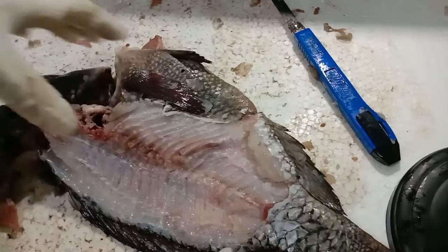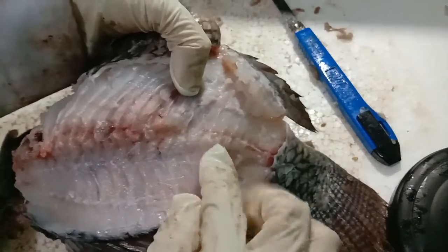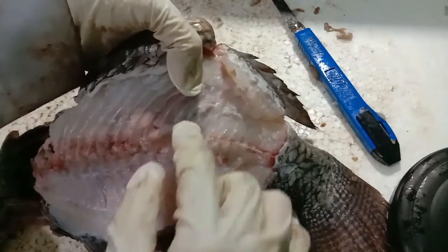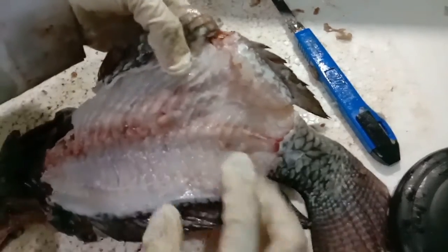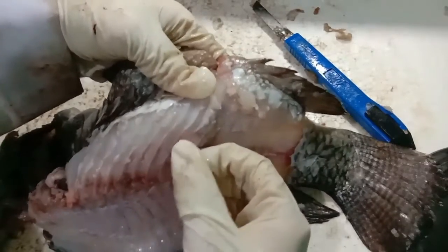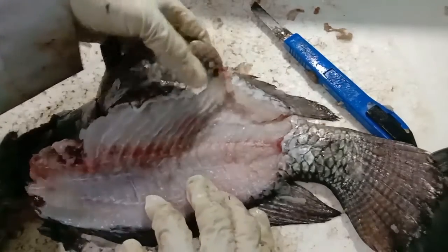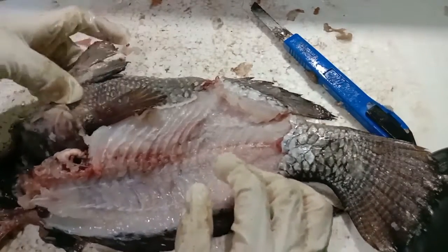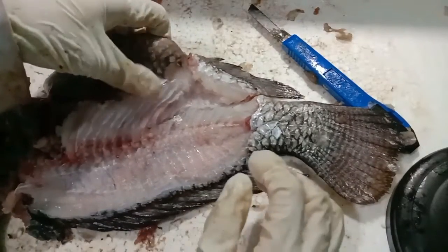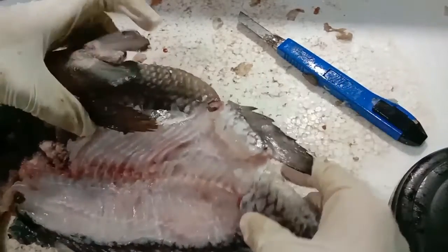Then there is a backbone. Here is the backbone in the middle, which is a bone structure that makes up the vertebral column. Then we have the rib bone here, which forms the thoracic cage. And at the very bottom of the trunk, there is the anal fin ray that forms the fin behind the cloaca. It's here.